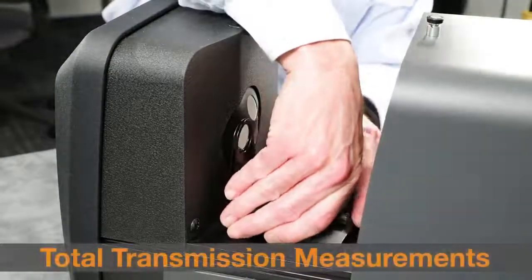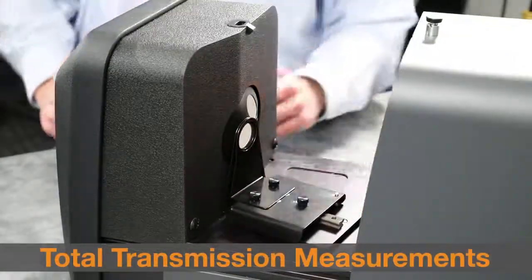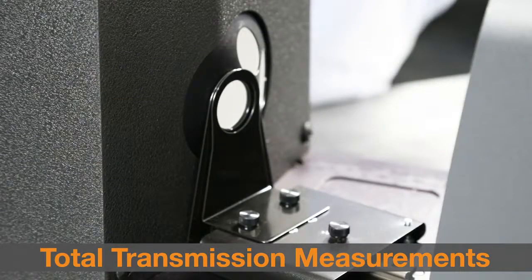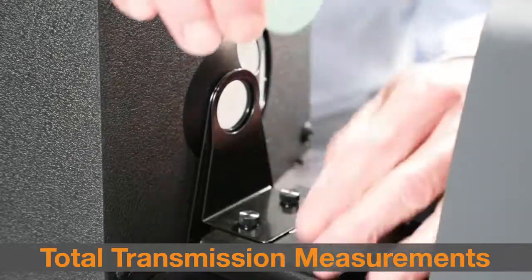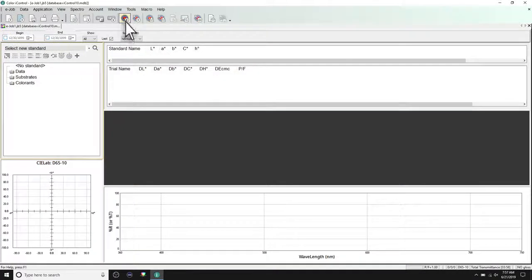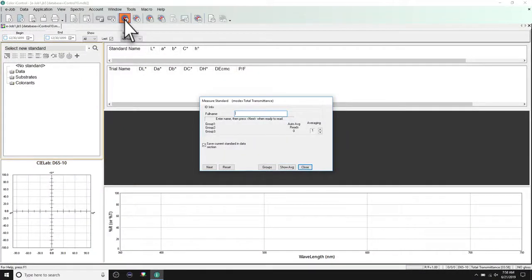Total transmission measurements are appropriate for measuring translucent samples which exhibit some scattering of the light. These measurements are taken with the sample positioned towards the sphere. Pull the clamp back and position the sample between the clamp and stop. Initiate a standard or trial measurement through your software.